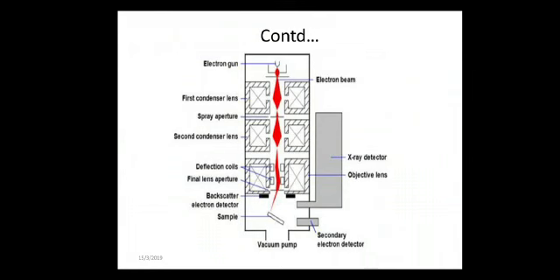So why do we need to use this in the characterization of solid materials, morphological aspects, or composition? Because the scanning electron microscope can detect and analyze surface fractures, and it provides information on microstructure. Examining the surface, variations in the chemical composition can be easily analyzed, and it also provides qualitative chemical analysis, and we are able to identify the crystalline structure of a constructed material.